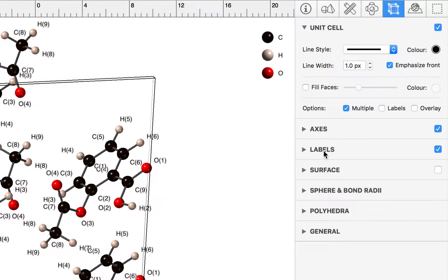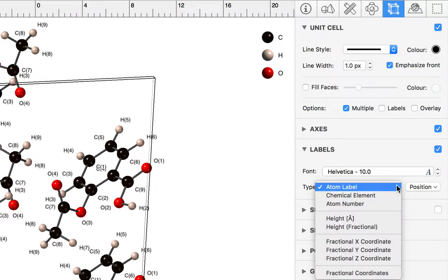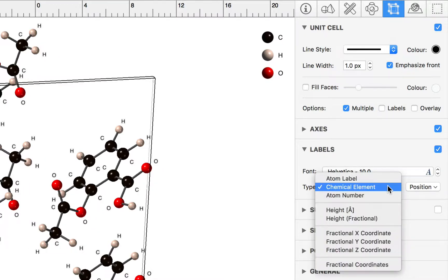Now you can control the label properties in terms of the size and the content of the label using this group. So you might want to just display the chemical element or the atom number or coordinates.